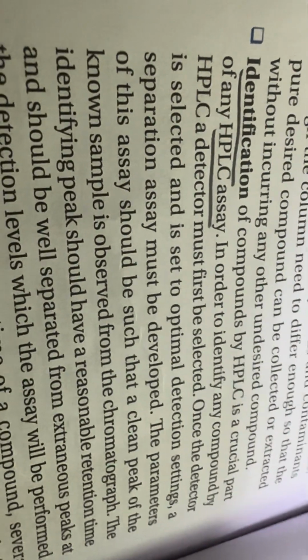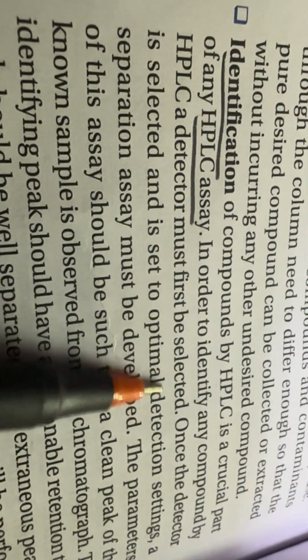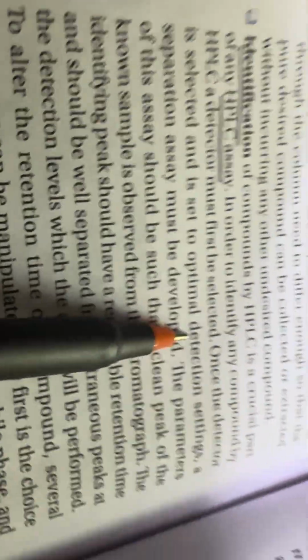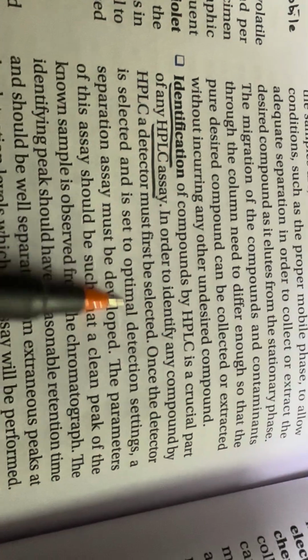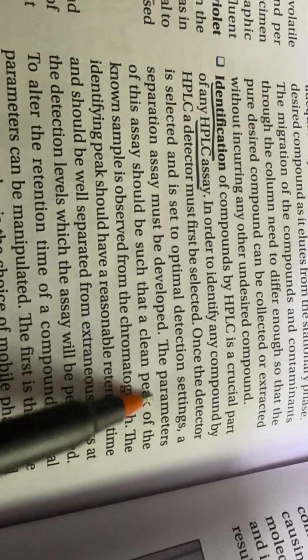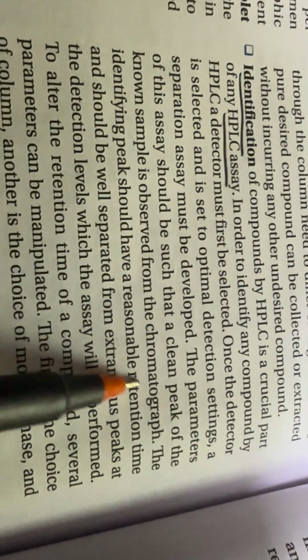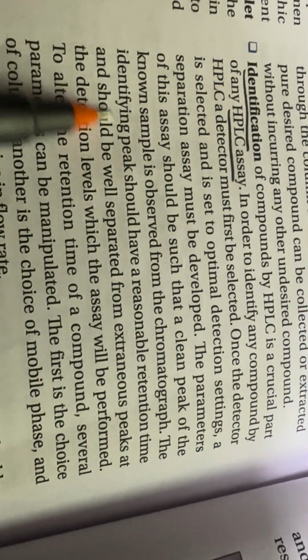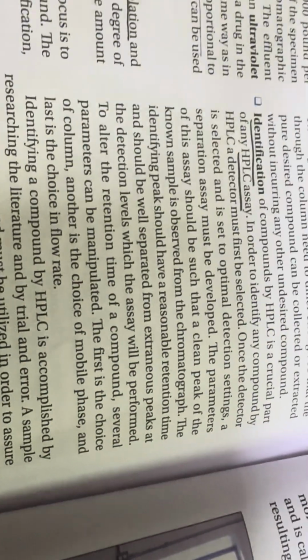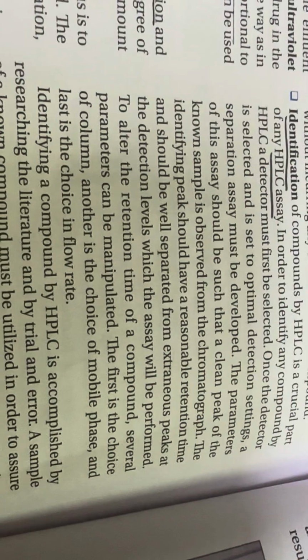Identification of a compound by HPLC is a crucial part of any HPLC assay. In order to identify any compound by HPLC, a detector must be selected. Once the detector is selected and is set to optimal detection settings, a separation assay must be developed. The parameters of this assay should be such that a clean peak of the known sample is observed from the chromatograph. The identifying peak should have a reasonable retention time and should be well separated from extraneous peaks at the detection level at which the assay will be performed.